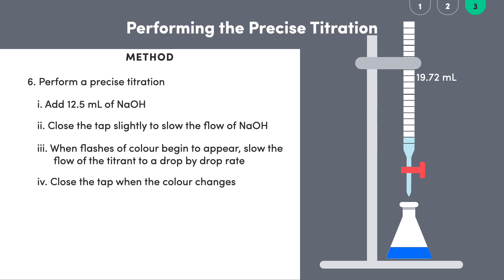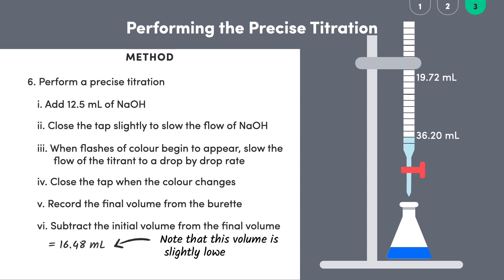So after that key last drop, record the final volume of the burette, here it's 36.20 milliliters, and subtract from this the initial volume, which was 19.72 milliliters, to get 16.48 milliliters as the precise volume of titrant required to reach the endpoint. Note that this volume, as expected, is slightly lower than our estimated volume.